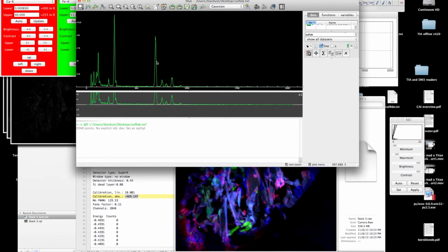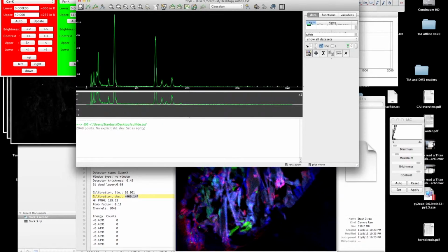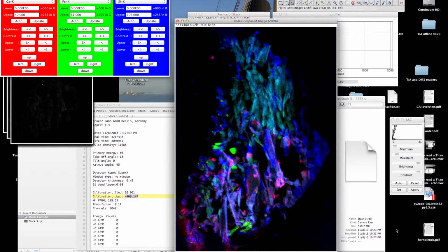And then this is your iron K, and nickel K, copper from my TEM grid, and the silicon from some other silicon stuff around this. There's actually a slight silicon one. This is a Stardust comet grain, by the way. And so I had actually written in this software a transformation that will set the energy axis right using that calibration, and you can do whatever works for you, depending on what software you use to read the spectrum. Okay, hope that is helpful. Bye.